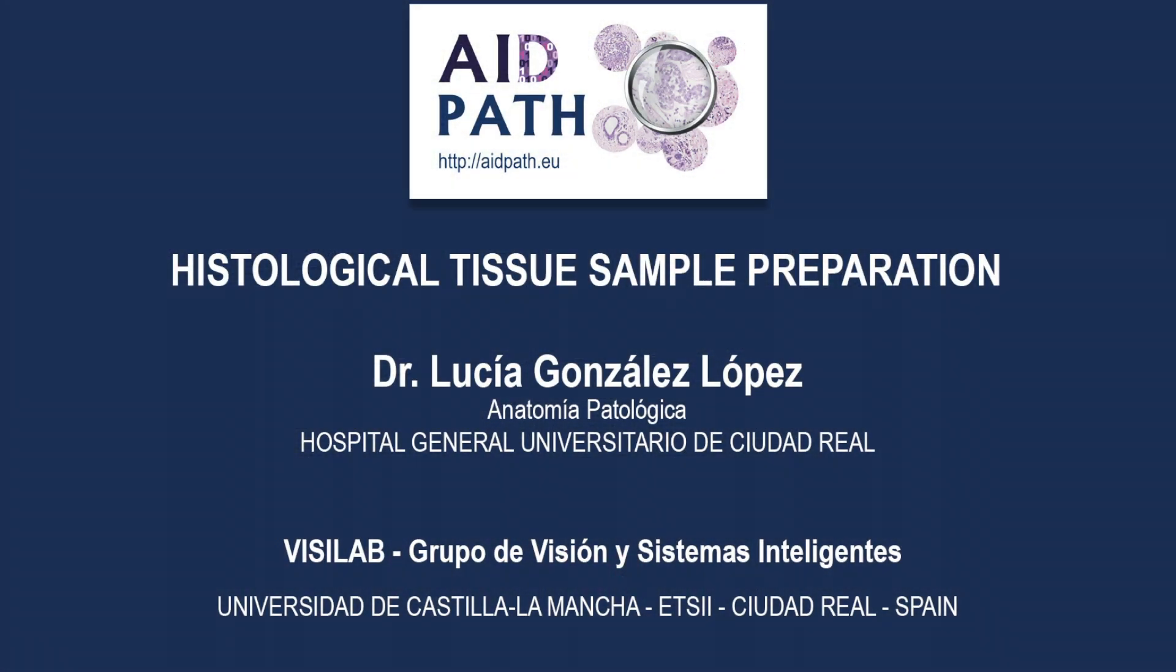Histological tissue sample preparation from a small cylinder of tissues to its diagnosis.